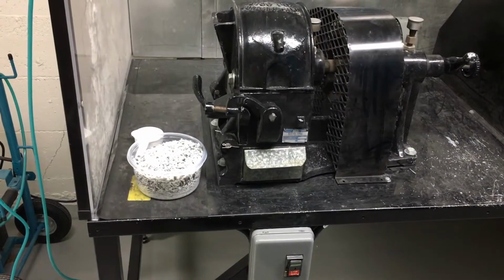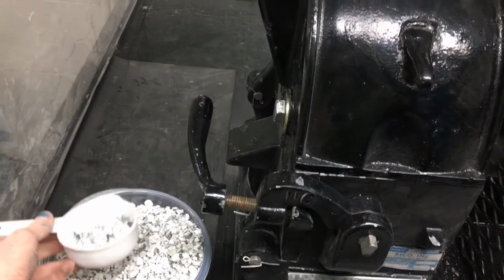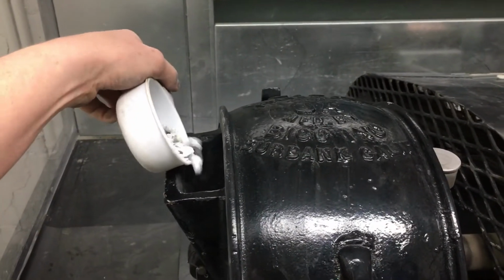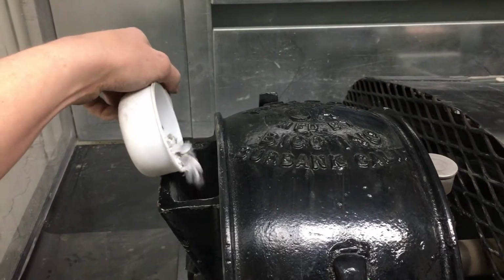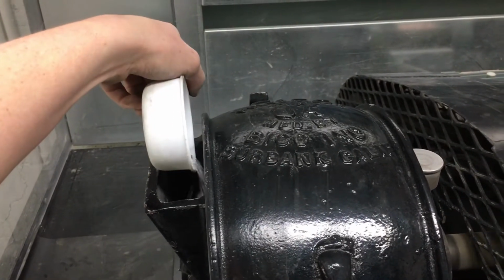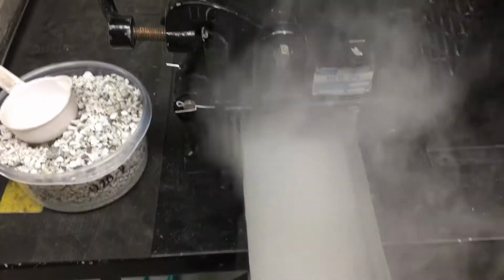Next, we move on to the disc mill. Let's get started. We'll pour the sample through. We don't want to pour too much in or else it'll seize, so we do a little at a time. And we'll check the bottom. Whew, quite a dusty process.